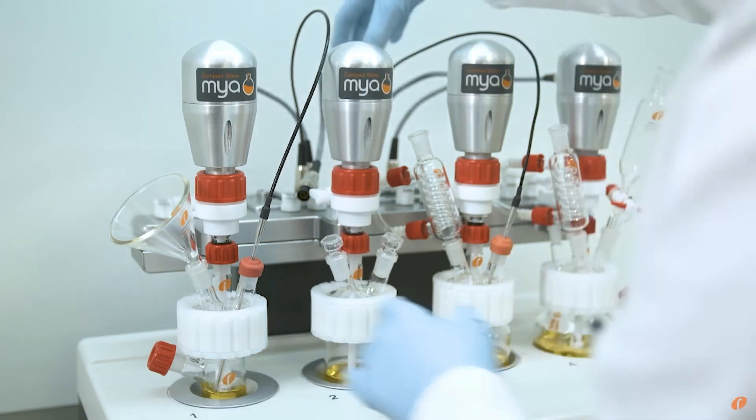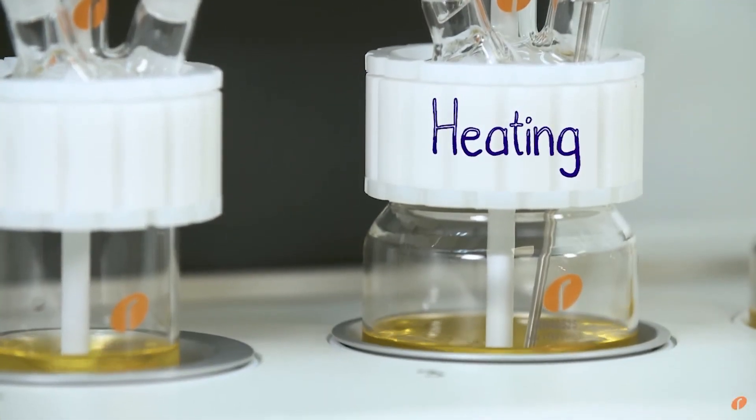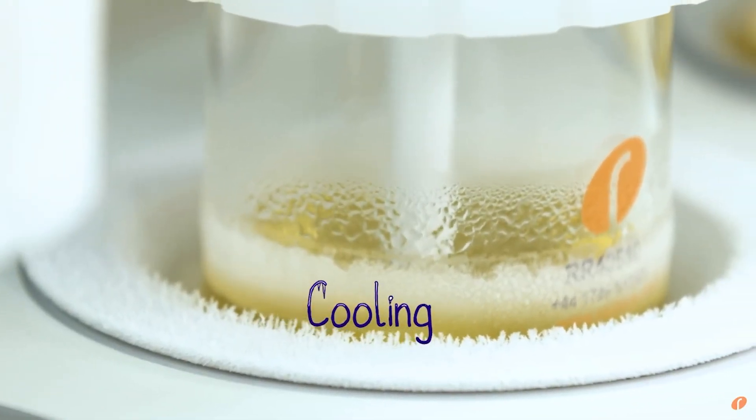One of the main issues with the water bath and round-bottom flask system is we were limited to doing one reaction temperature, so we could only do one project at a time or look at one variable. The other downside was whenever we scaled up into pilot or into process vessels, we had to reformulate because of the different mixing.